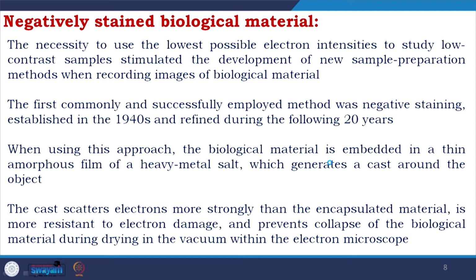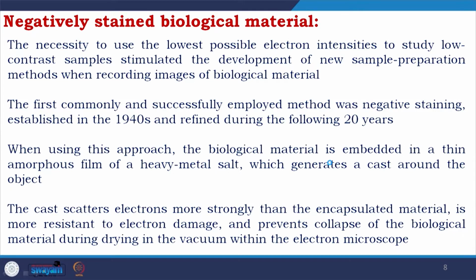The first commonly and successfully employed method was negative staining, established in the 1940s and refined during the next 20 years, with alterations of the material, how to use them, how to prepare them and all these things.